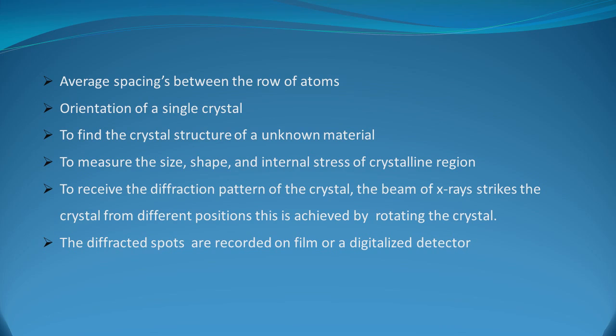The orientation of the sample can also be studied: if we take a single crystal for analysis, the directions of the single crystal can be studied to find the crystal structure. It is important to know which category the material sample belongs to. This is the major diffraction technique used to study the structure.